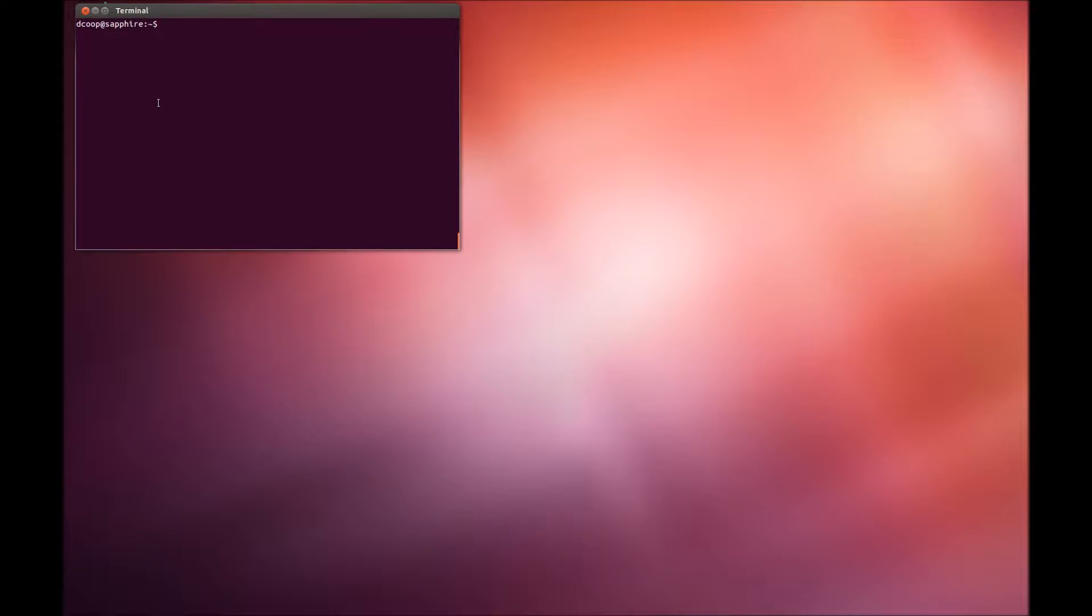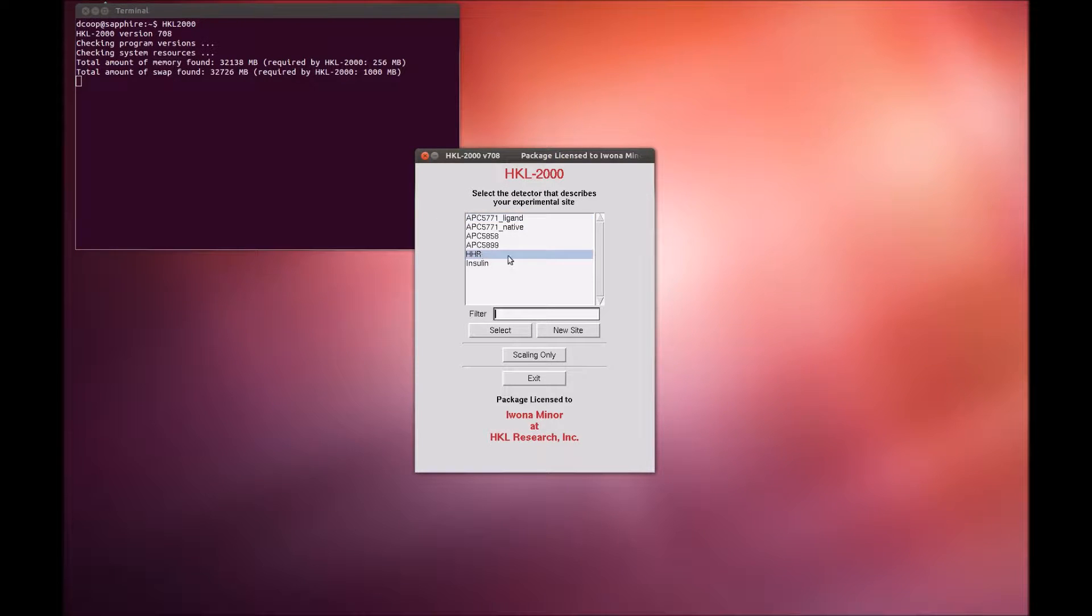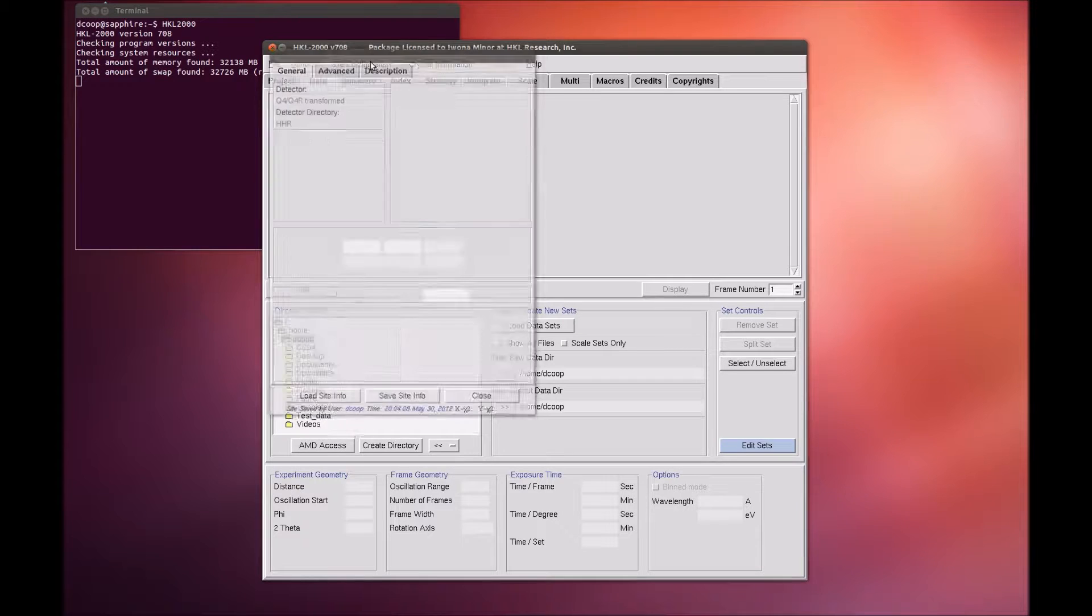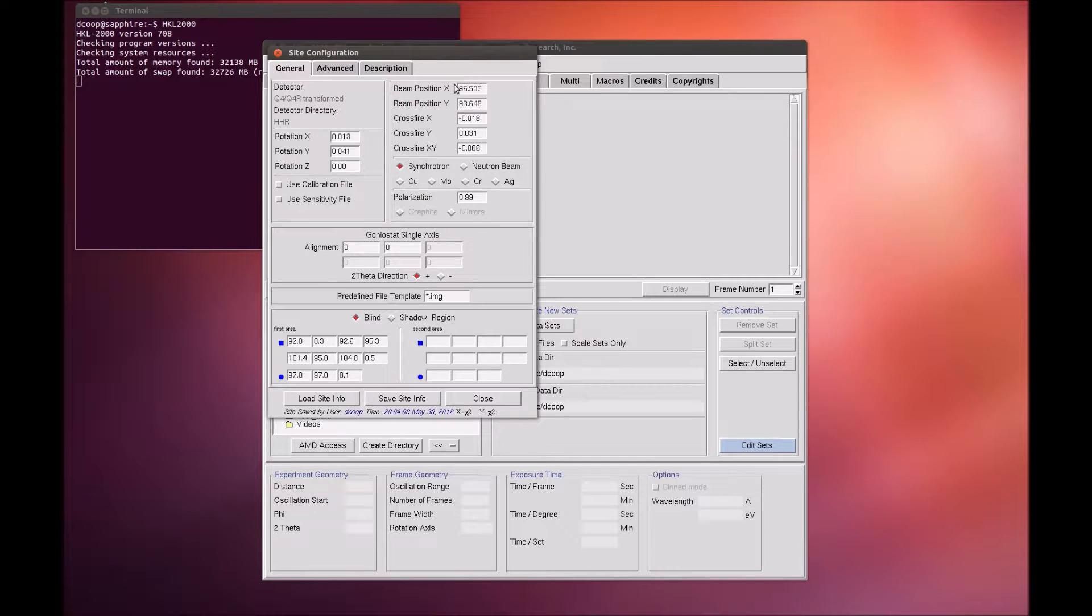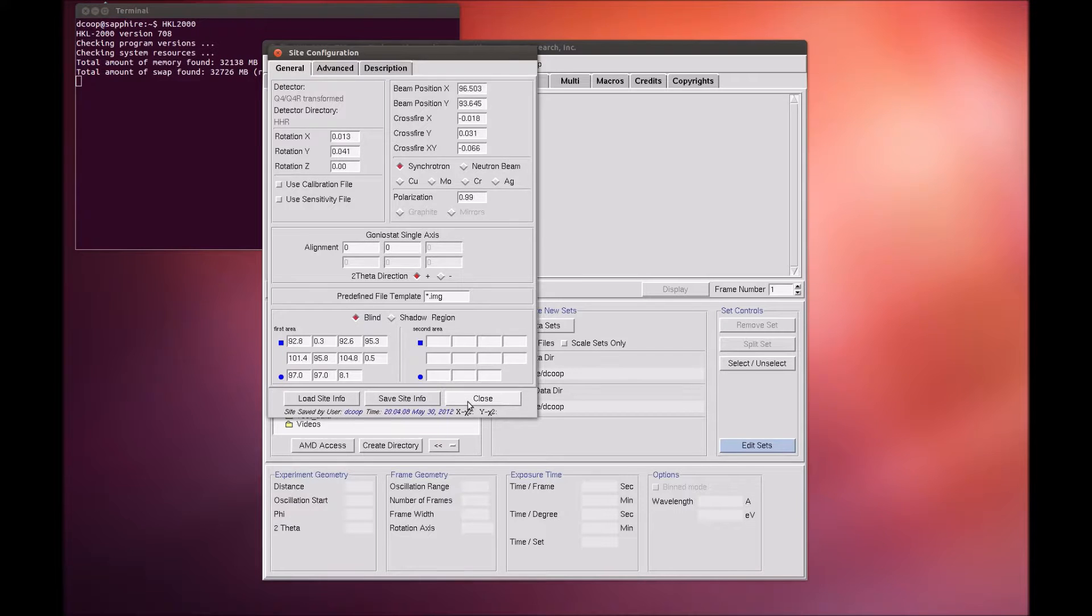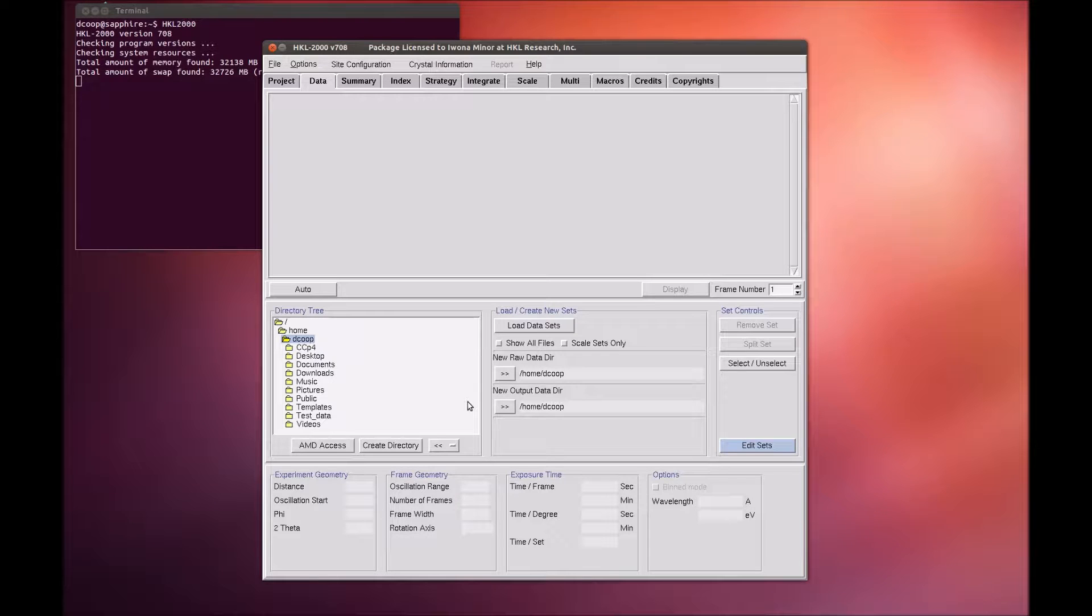When you start HKL, you are first presented with a list of experimental sites. The site definition contains information about the x-ray detector and other parameters that describe the experimental setup. The most important parameters are the detector type and the position of the direct beam. For this tutorial, we will use the site called HHR, which corresponds to the ADSC-Q4 detector.